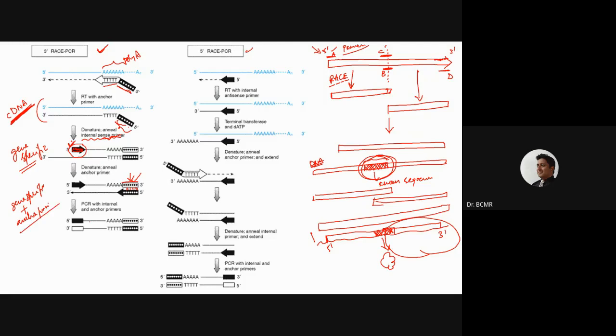And then the only product that will get amplified is the gene of interest, right? There could be, because of this region, other mRNA or cDNAs polymerized too, but they will not be amplified at the exponential stage.